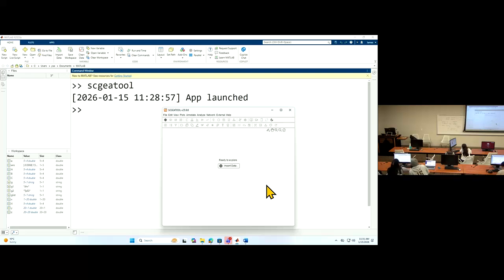Good. So you can use example data to play with this. So that will be the interface. We will import data generated from Cell Ranger using this to get this information in.